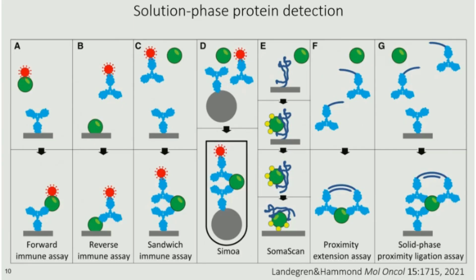Then you have the SomaScan assay from SomaLogic, which is very unusual and different from others. It uses aptamers, as you know, and it requires first that they capture the protein, and then you biotinylate the protein, and then you release, and now you capture the biotinylated protein, and you detach the attached aptamer and read off the identity of it. And that turns out to be highly scalable and sensitive. But then on the two right, you see the proximity extension assay that's made by Olink Proteomics. And I just illustrate one version where you have a capture antibody first, and then you do the proximity ligation step.